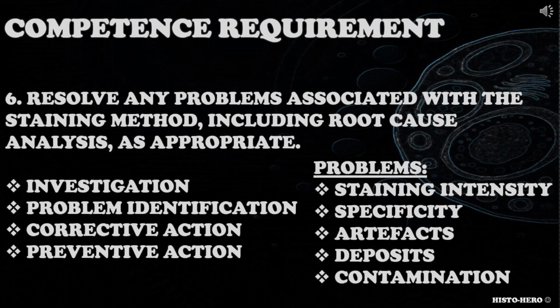The sixth competence requirement is resolve any problems associated with the staining method, including root cause analysis, as appropriate. Candidate should be able to troubleshoot H&E staining. Does the candidate resolve problems with H&E staining? Can they identify and solve the common problems? Do they record problem resolutions accurately?